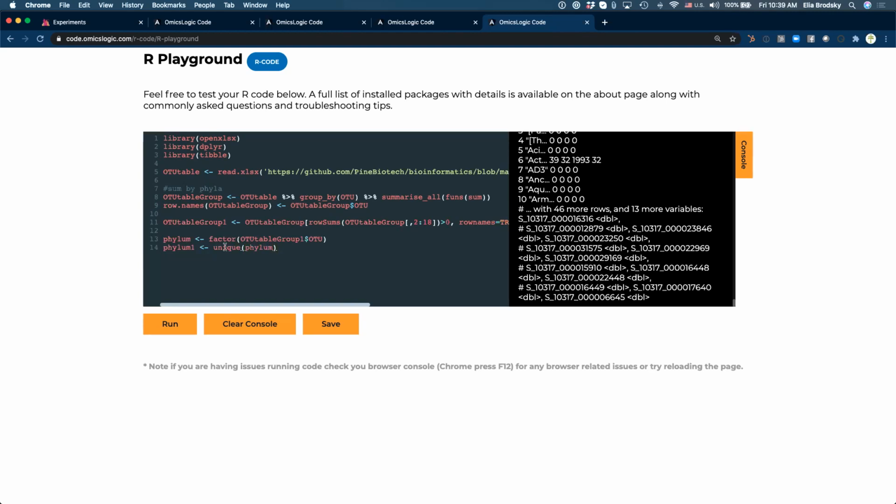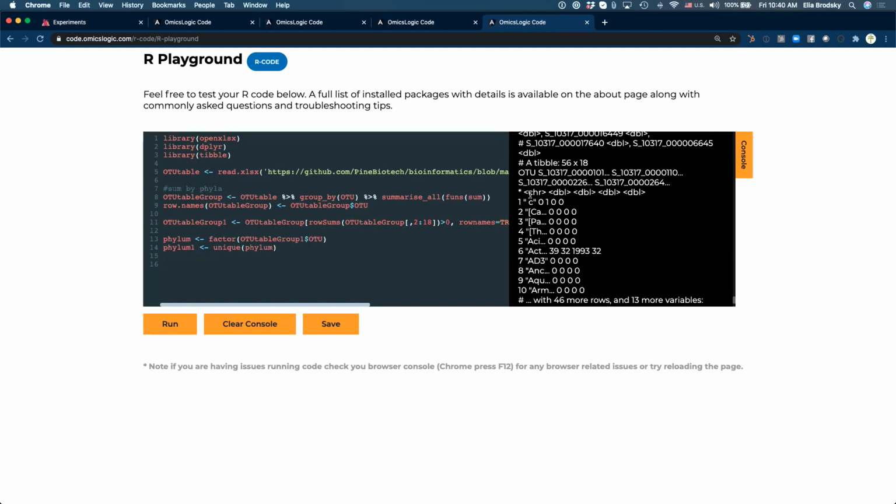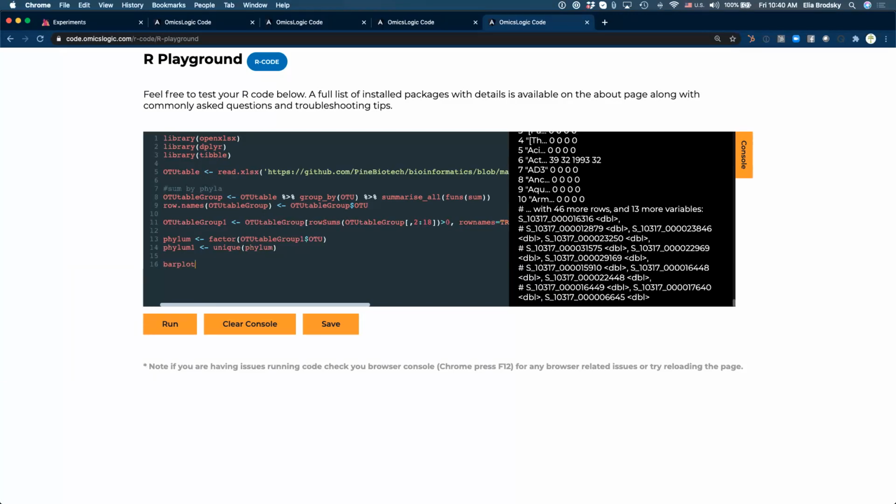All right, now let's take and make, okay, so because our OTU table group has the names of our phyla in column 1, and then all of the rest go on after that. Okay, so then we want to create our bar plot, right? So let's make a bar plot.